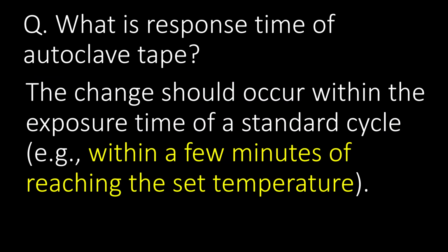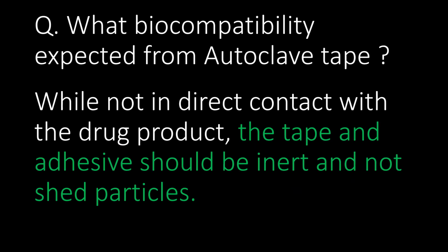What is the response time of autoclave tape? The change should occur within the exposure time of a standard cycle, for example, within a few minutes of reaching the set temperature. What biocompatibility is expected from autoclave tape? While not in direct contact with the drug product, the tape and adhesive should be inert and not shed particles.